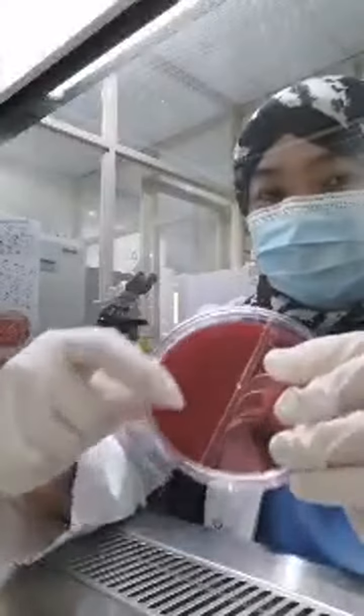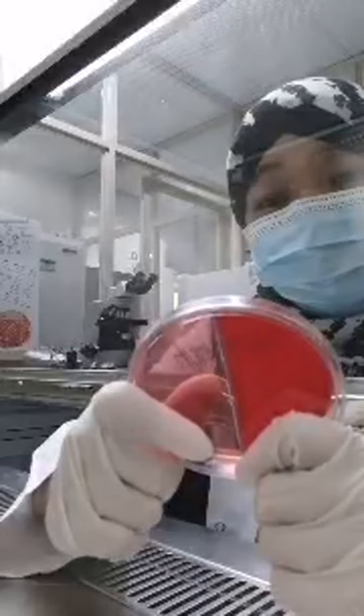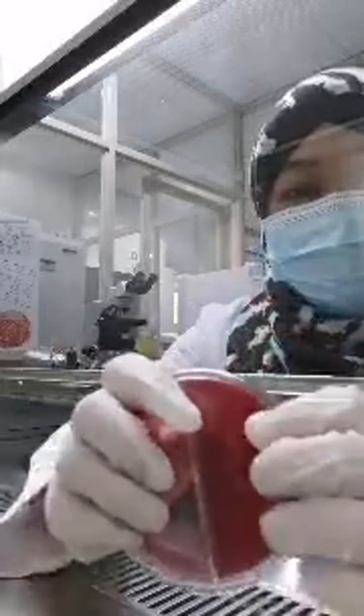For the blood agar, this contains sheep blood agar.